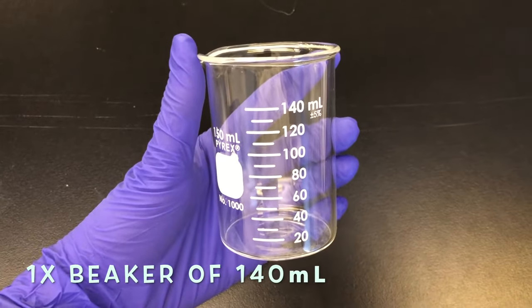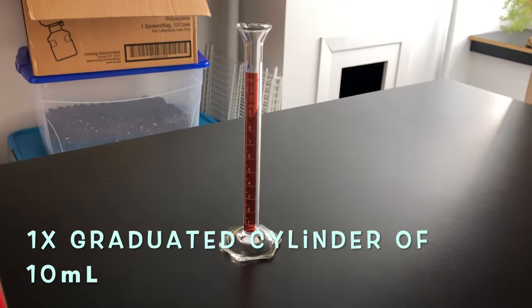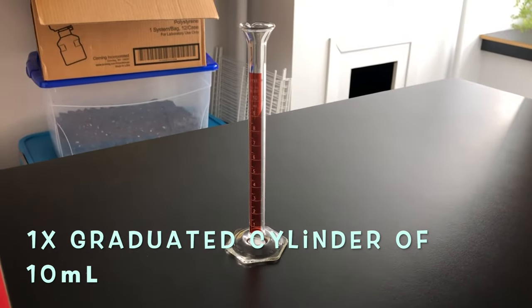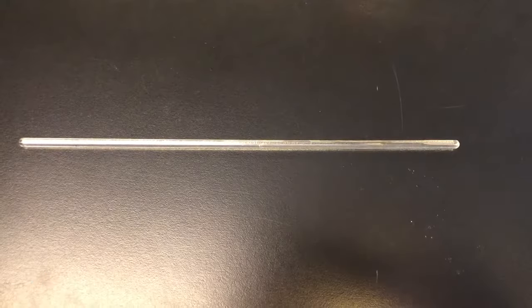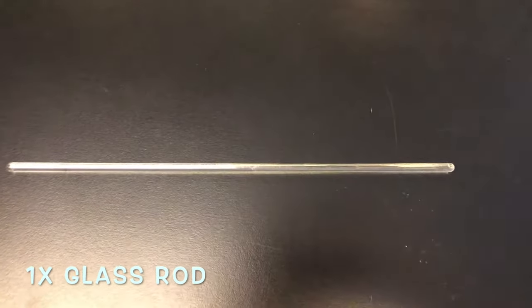We'll have one small beaker of 140 ml. You will also need a graduated cylinder of 10 milliliters and a glass rod to mix your bioplastic mixture.